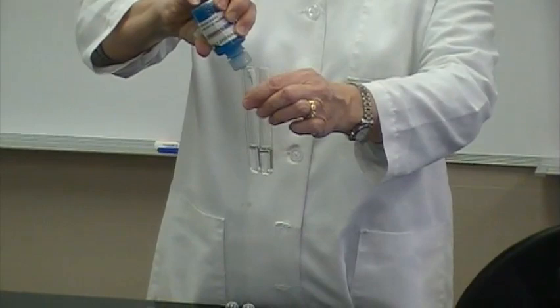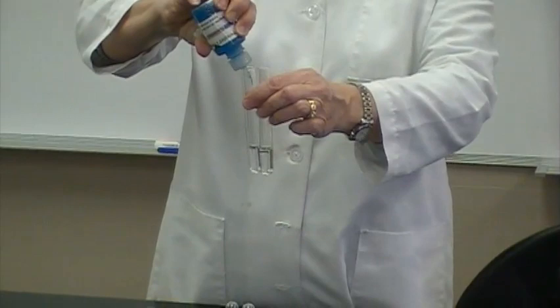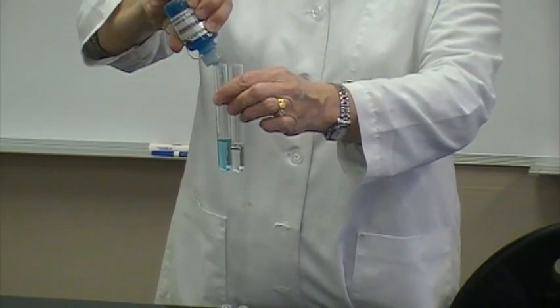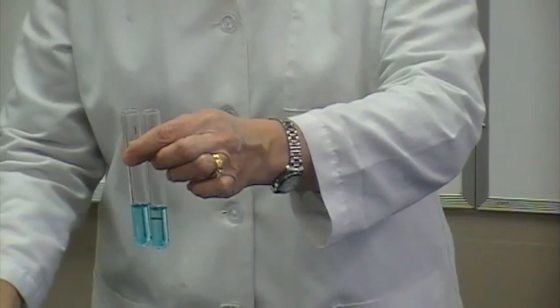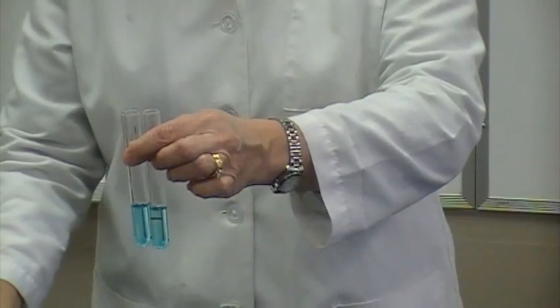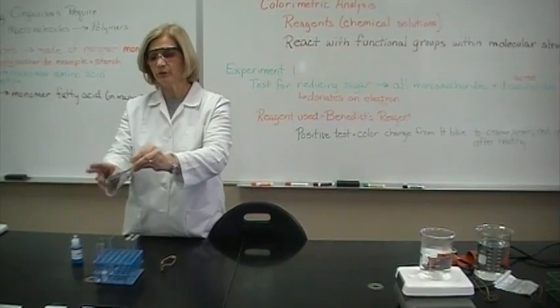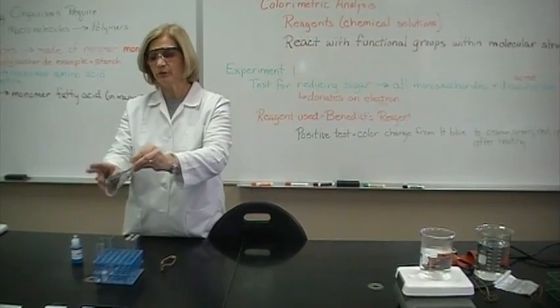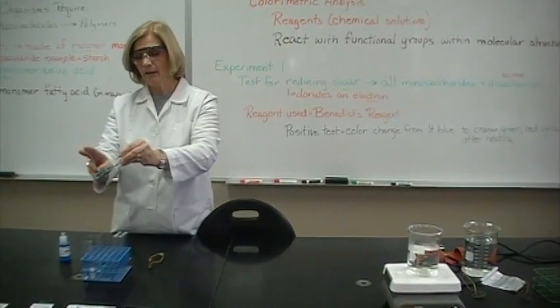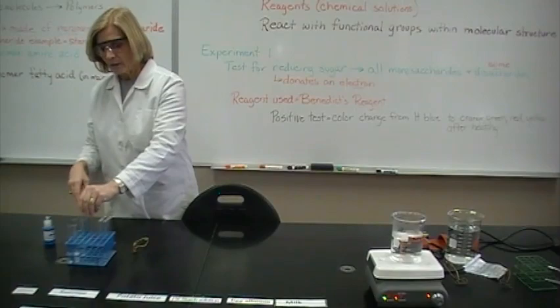Benedict's reagent is in a dropping bottle on your tables. You require at least 20 drops of solution to be placed in each tube. In the laboratory we try not to ever shake tubes as it can be dangerous. The safest way is to grasp the mouth of the test tube using two of your fingers on the opposite hand. If you will tap the bottom of the tube it will mix the chemicals thoroughly. So be sure to tap all of your tubes.